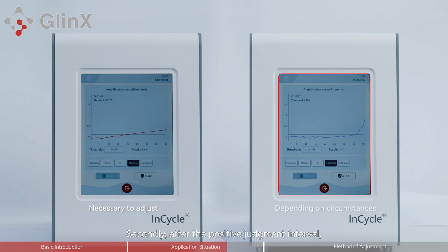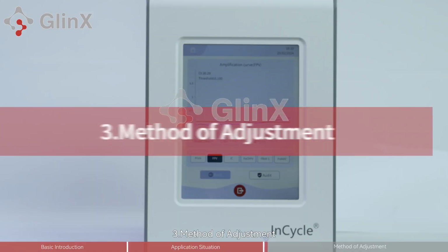Secondly, after the positive judgment interval, if the amplification curve shows typical exponential amplification, indicating a low pathogen content in this sample, the threshold can be adjusted according to the actual situation. 3. Method of adjustment.